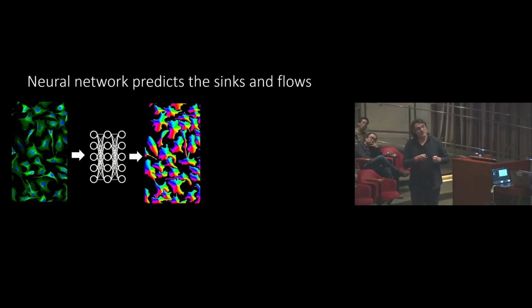They are effectively constructing a little dynamical system for every one of these masks, so that when we use these masks and ask every pixel to point to the next nearest pixels, and next, and so on, and we kind of run the dynamics of these pixels, all of those in the same mask will just go and agglomerate in the same point in the middle. And that's how we know that those pixels belong together in the same mask.